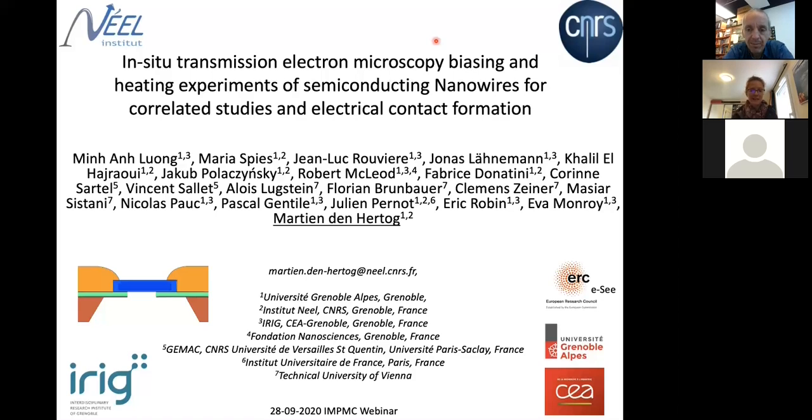I'm Martien den Hertog, and I will present our work about in-situ transmission electron microscopy, biasing and heating experiments of semiconducting nanowires for correlated studies and electrical contact formation.